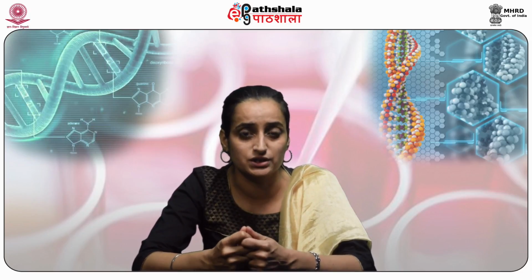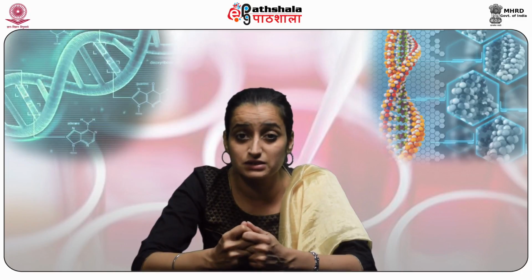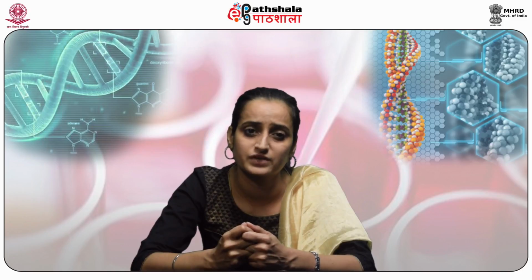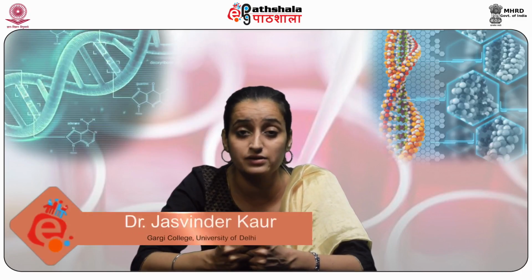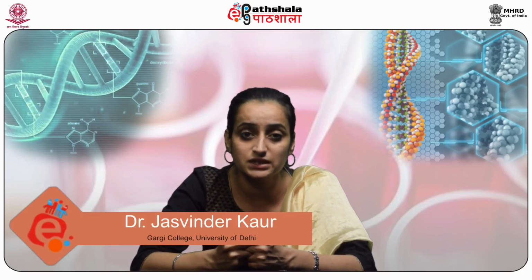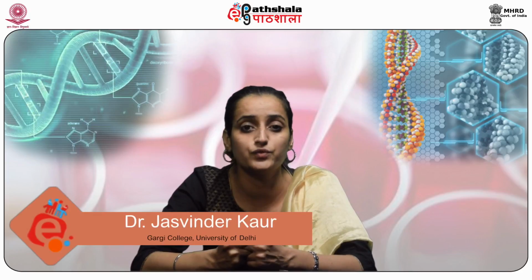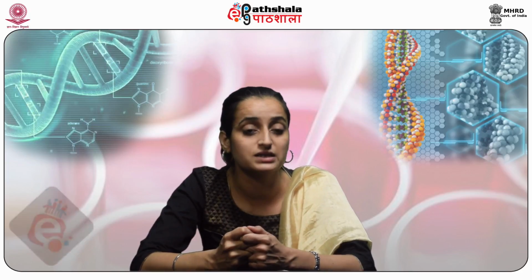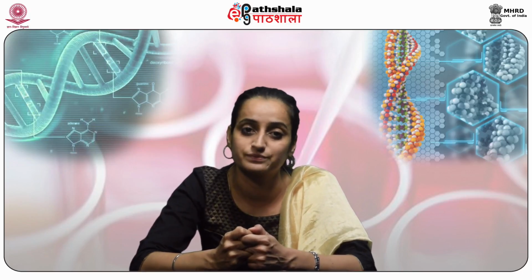In-situ hybridization is seen as an expensive, labor-intensive, and time-consuming process, and also requires knowledge of bacterial expression, cloning, and in vitro transcription. Still, it is a very powerful technique and can be used in various fields including developmental biology, pathology, sex determination, chromosome mapping, and microbiology. Thank you.